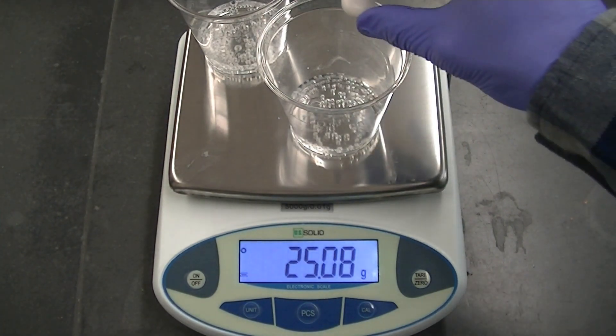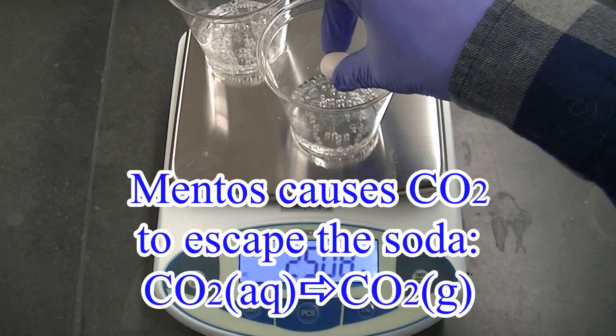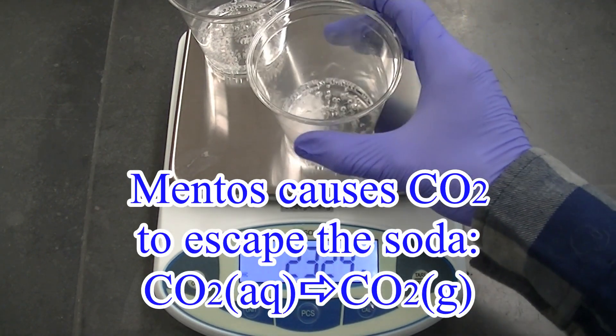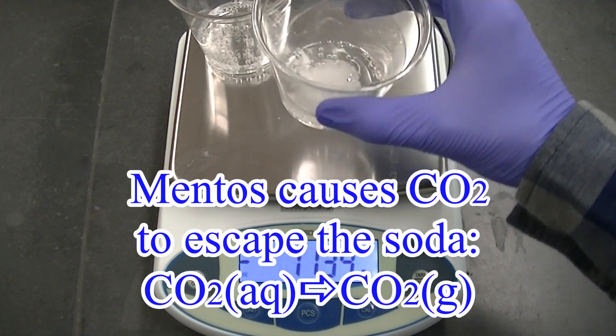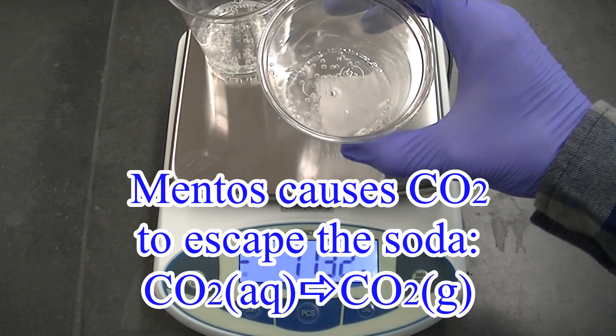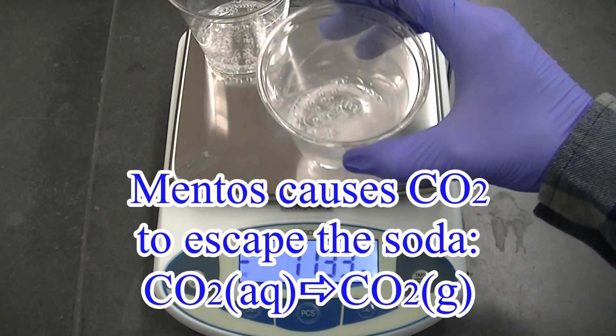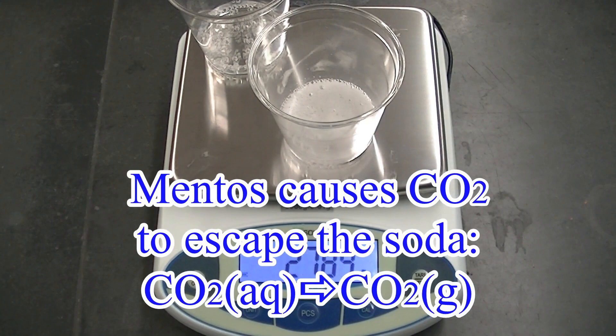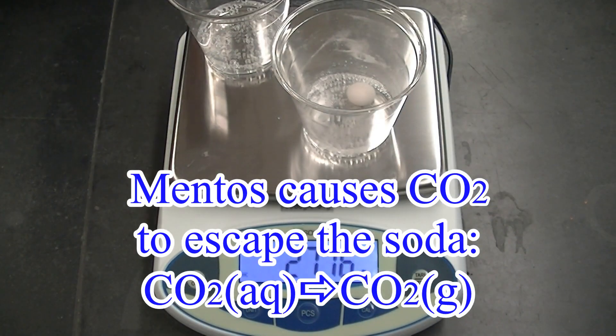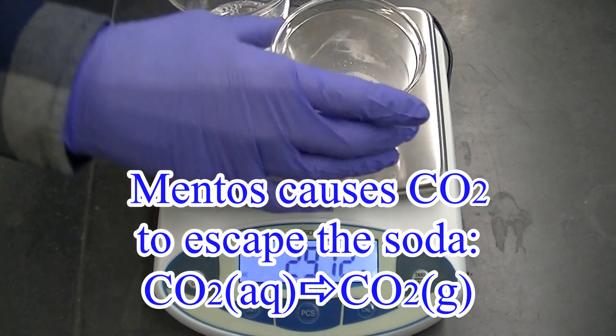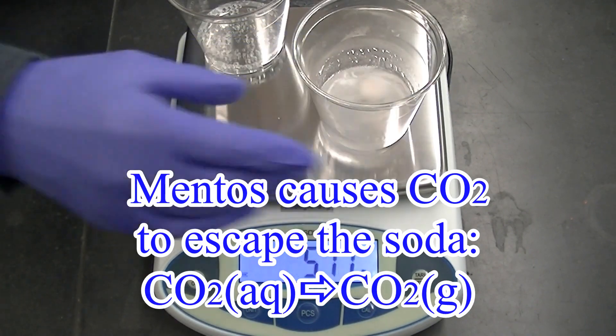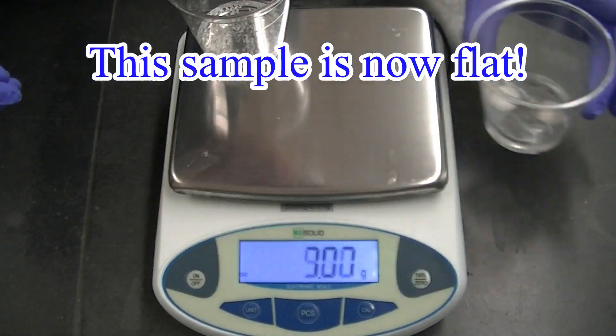Now we'll degas this sample by adding a Mentos candy to it. The Mentos candy causes the carbon dioxide to come out of the soda. Let's add another one to help it come out a little better. I'm going to leave that off to the side.